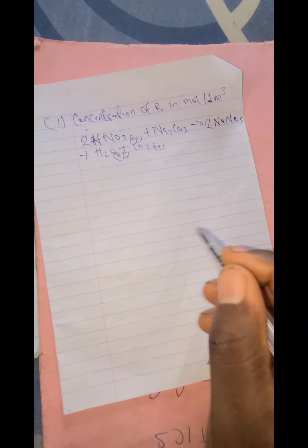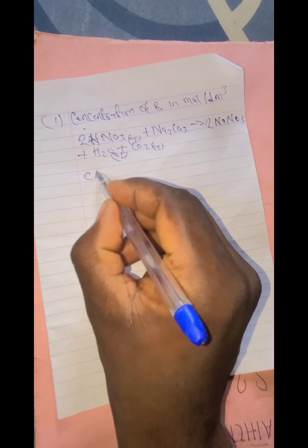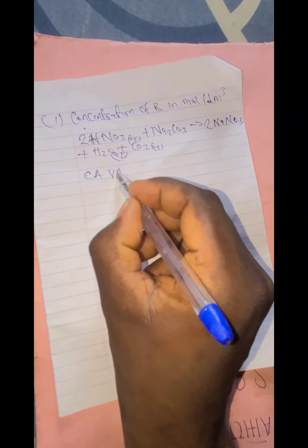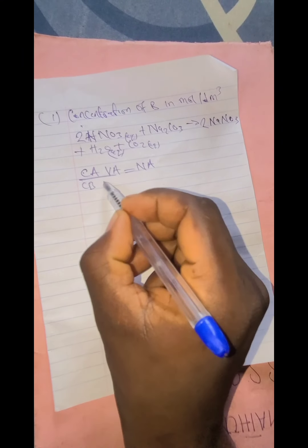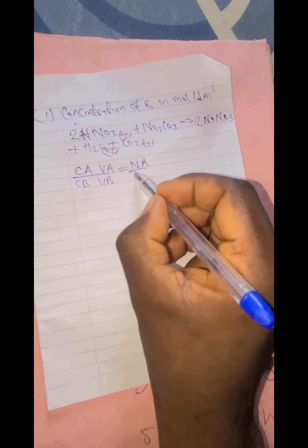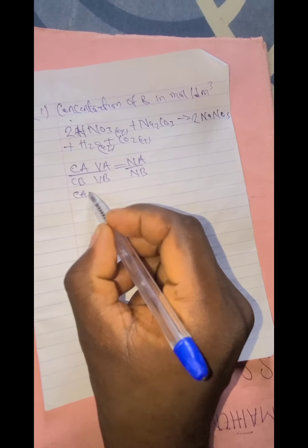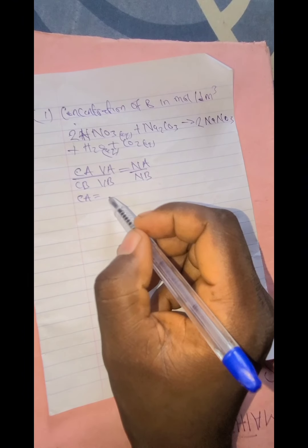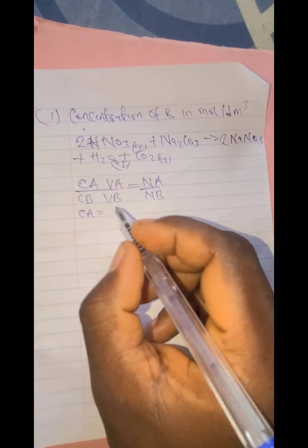So in calculating the concentration of B in mole per dm cube, you are going to use CaVa over Na equals CbVb over Nb. Ca is the concentration of the acid, which was given in the question as 0.100 mole per dm cube.